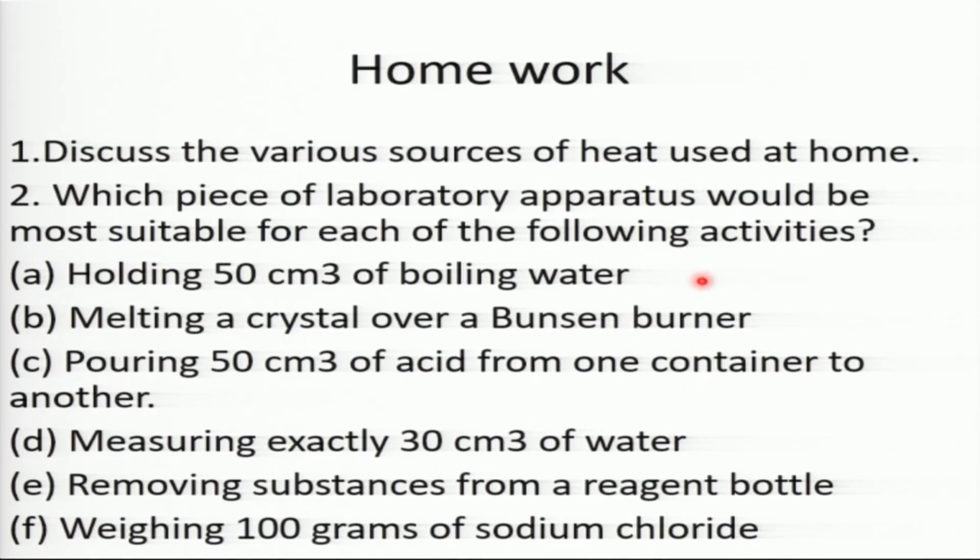So among the apparatus we have studied, which one is suitable for all this? 1, holding 50 cubic centimeter of boiling water. What apparatus do you need to use among what you have studied? Another thing, melting a crystal over a Bunsen burner. So I'm melting a crystal over a Bunsen burner. Which one should I use among what we have studied?